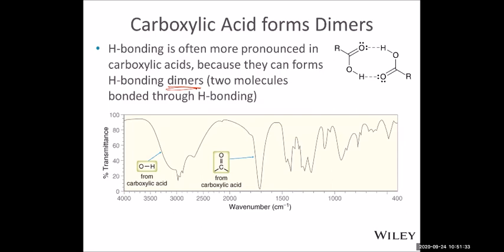Or which compound is which, basically. Infrared is more about telling who is who. When you have a pair or couple of compounds, you know the formulas but don't know which one has what formula, you use infrared. Very helpful.